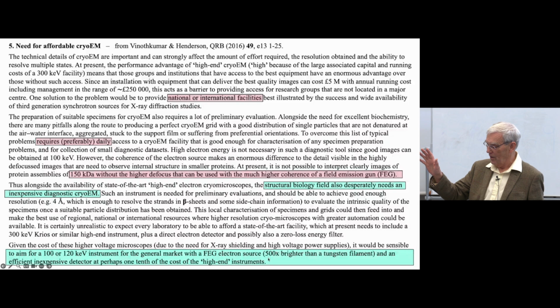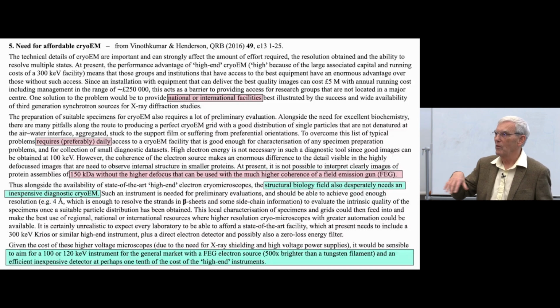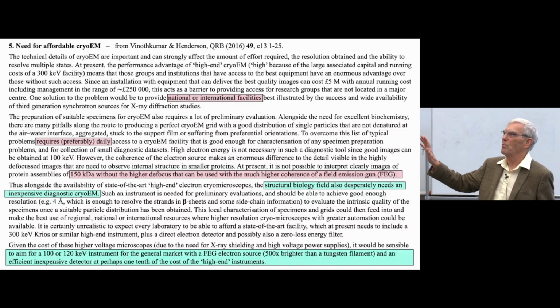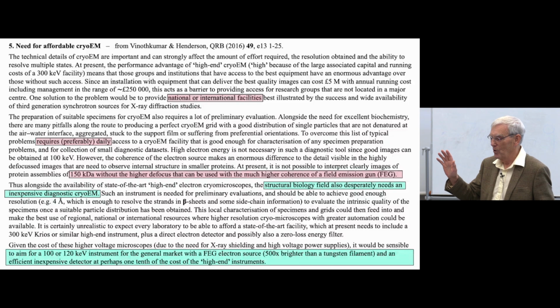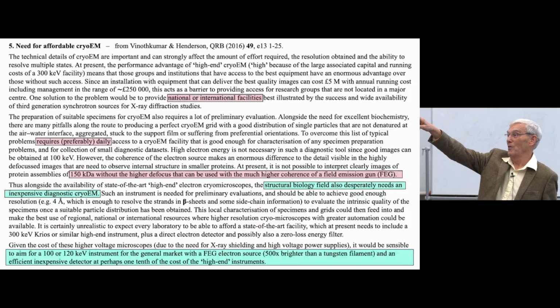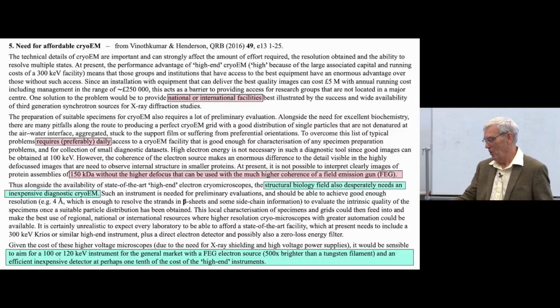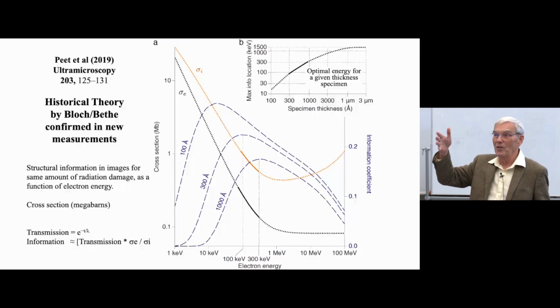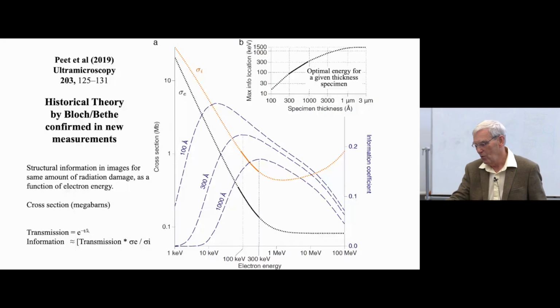And just at that moment, someone came through the lab, one of the Thermo Fisher microscope manufacturers. He was doing some private work. He said, I know somebody in York who makes field emission guns that might be just right for your microscope. This is Mohammed El-Gamati, who's here, row 4. So anyway, we got together with Mohammed and with an X-ray detector company that made X-ray detectors that could be useful. And this was the paper.